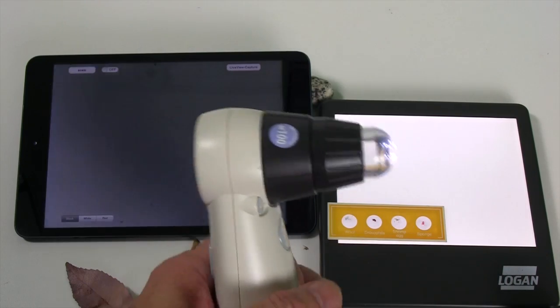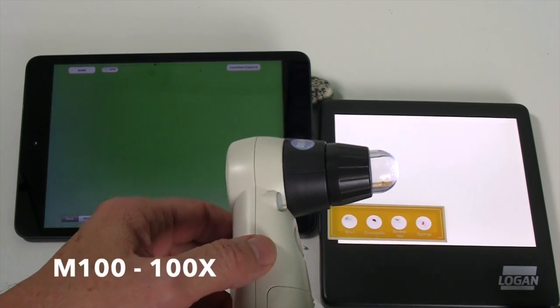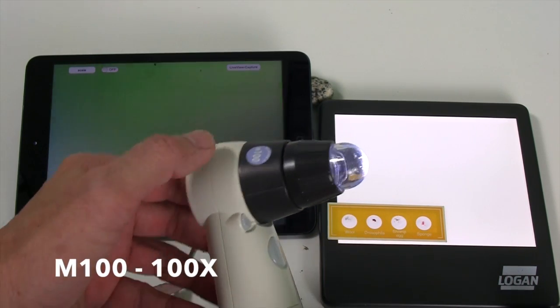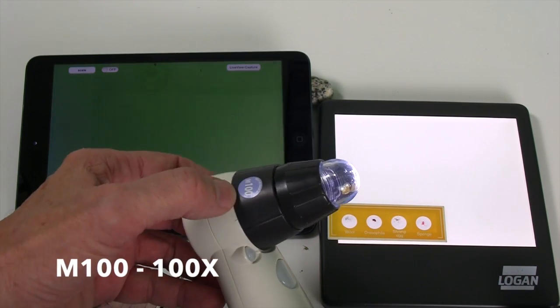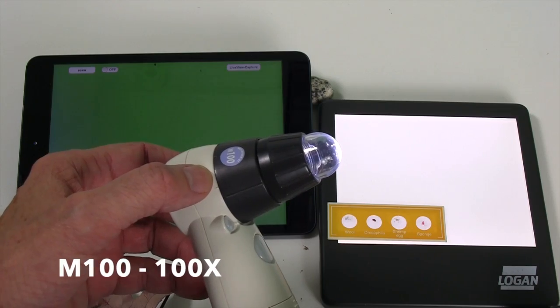This episode I'm going to be talking about the 100 power and 200 power lenses, which are used for the ProScope HR and the ProScope HR2, our USB models, as well as the ProScope Mobile, our Wi-Fi model.